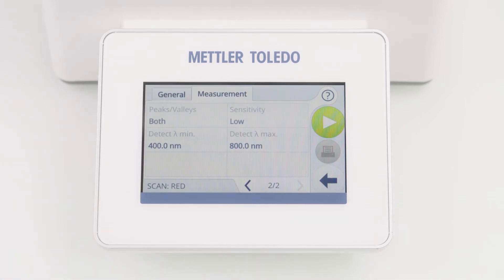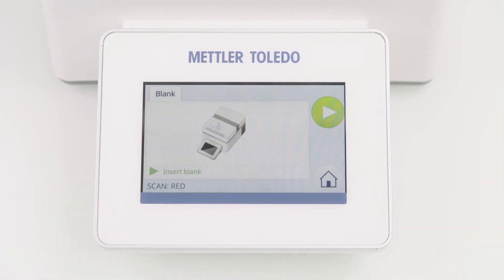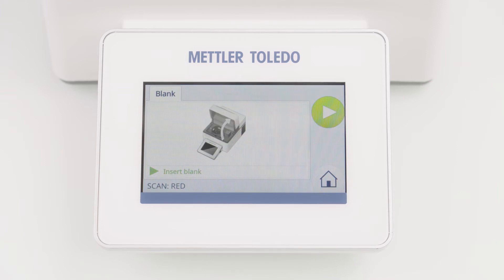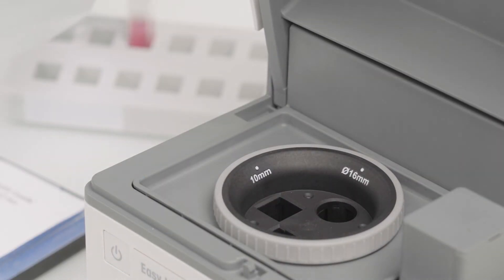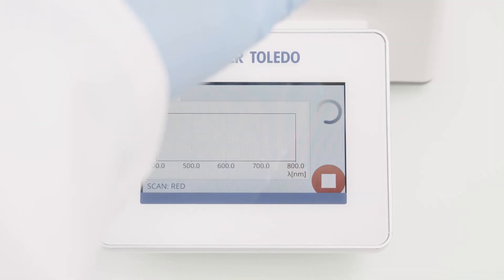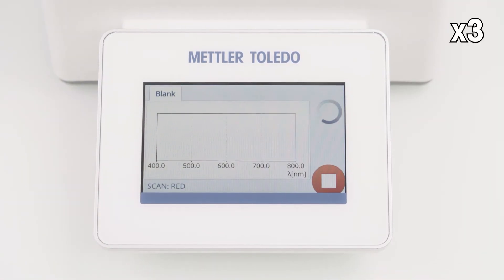Now the method is completely defined and we are ready to perform the measurement. To start the method, I am clicking the green Start button. The instrument now guides me through the whole workflow. First, I need to perform the blank measurement. I follow the instructions shown on the screen, press the lid to open, insert the blank cuvette, close the lid, and the blank determination starts automatically. The scanning progress is shown with a moving bar.